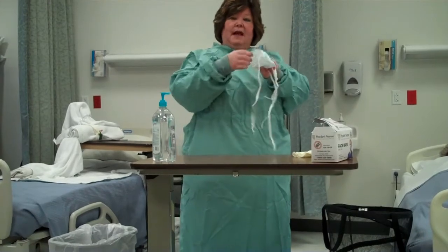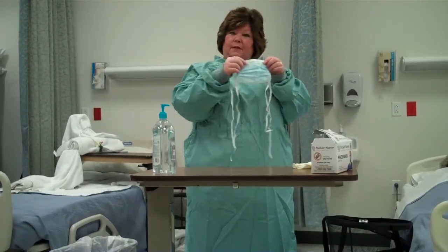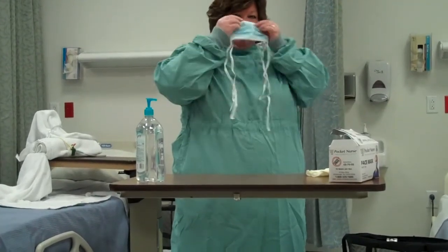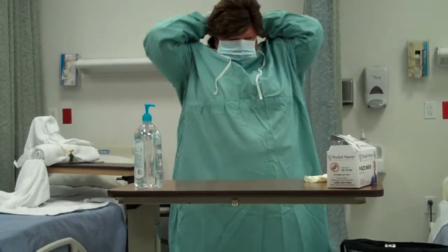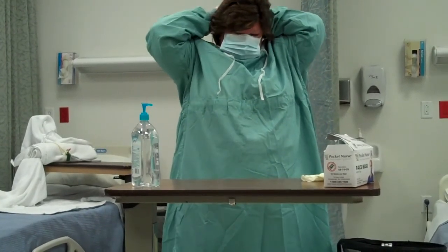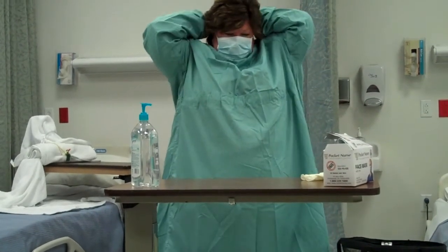Now we're going to put on the mask. If you notice, one side is blue and one side is white. We're going to put the white side against our face, and we're going to bend this little wire to fit around our nose. I'm going to secure this up over my ears and tie it. I'm doing the top one first, and now the bottom one.